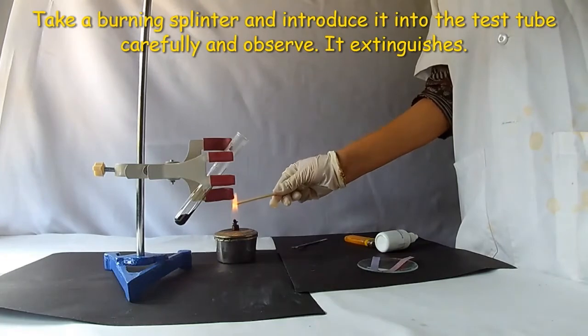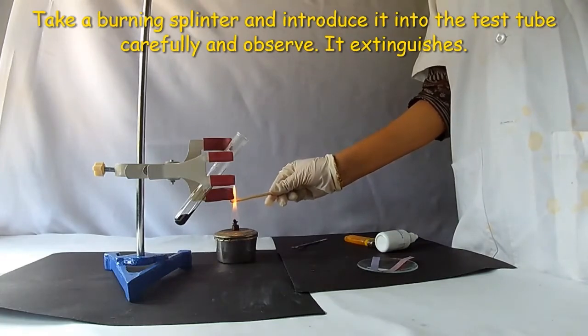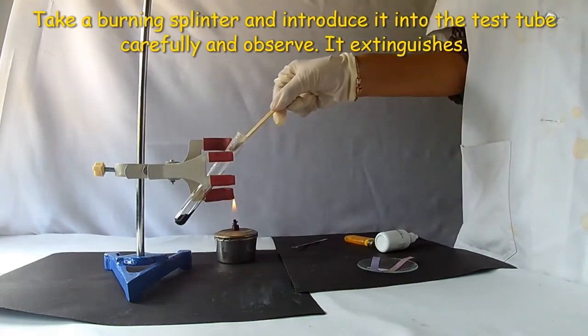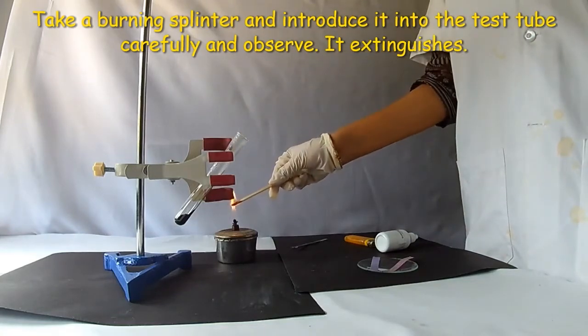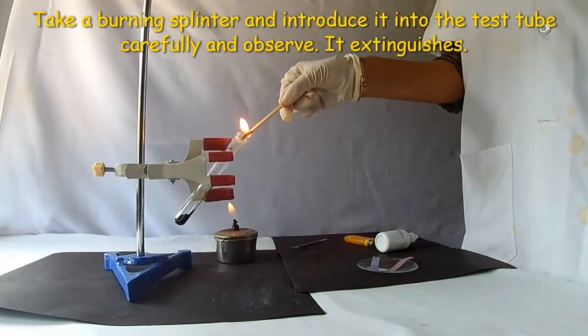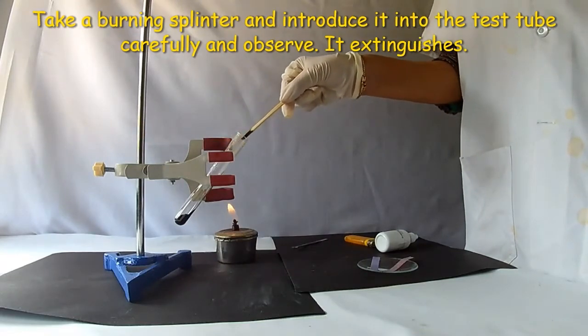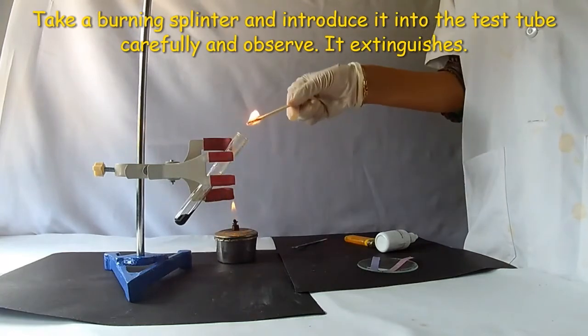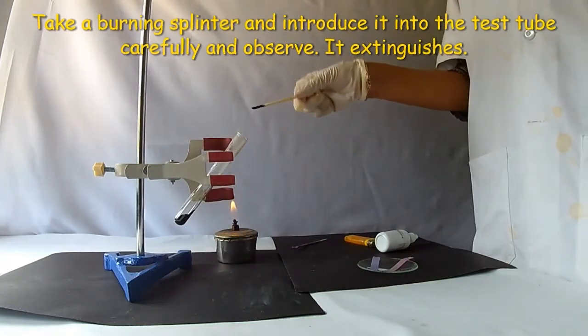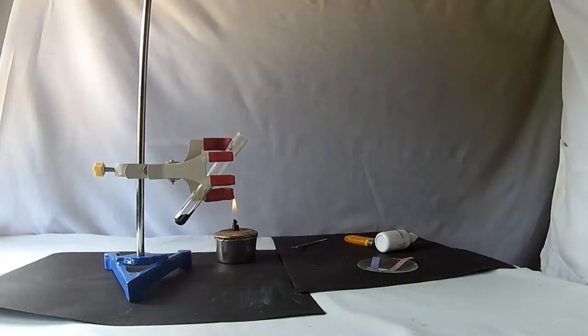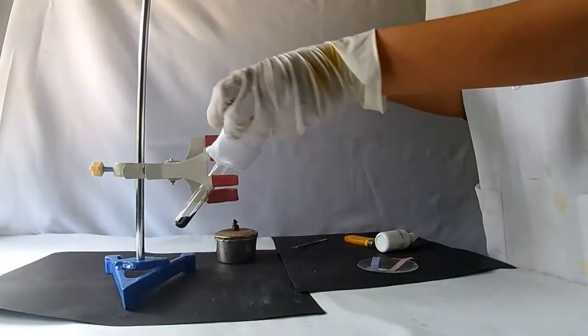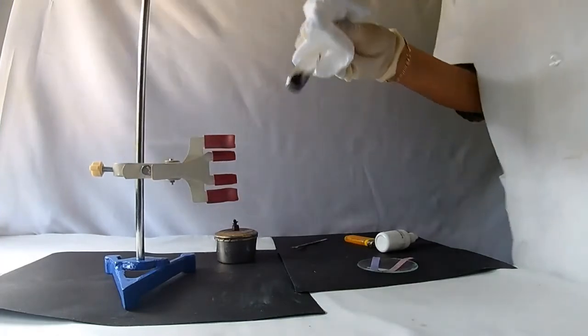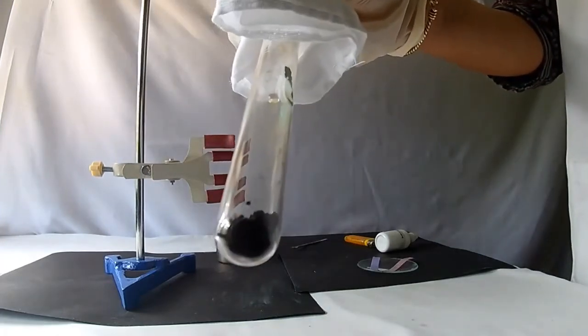Now, introduce a burning splinter into the test tube. It extinguishes, proving that carbon dioxide is not a supporter of combustion. Observe the color of salt. It has changed to black.